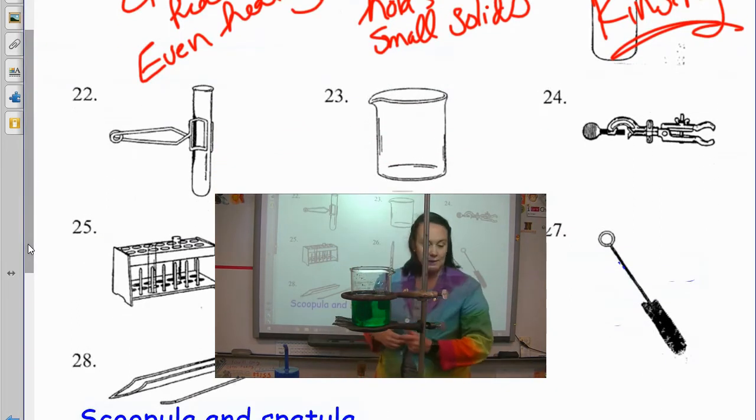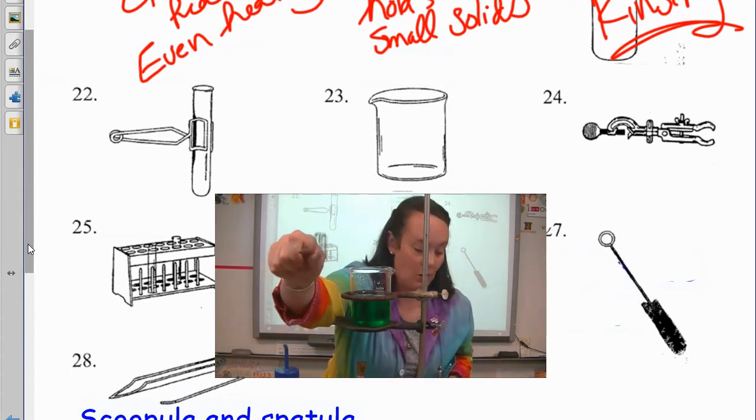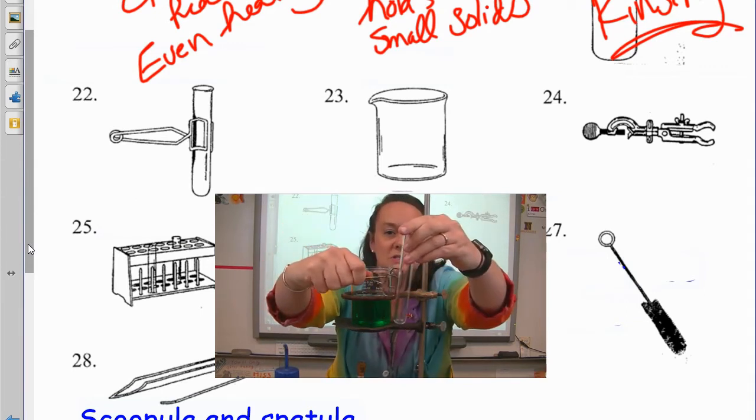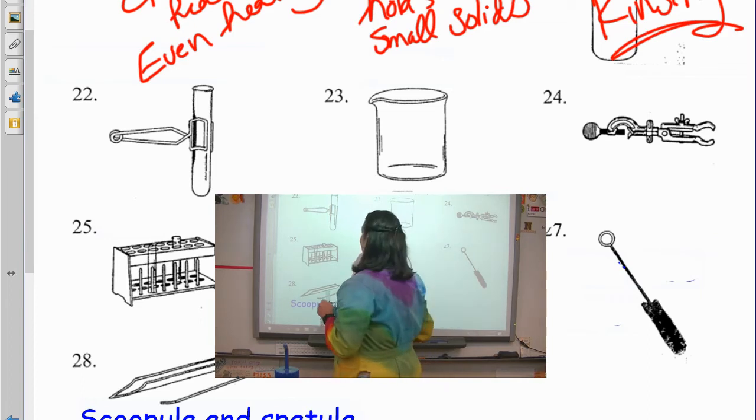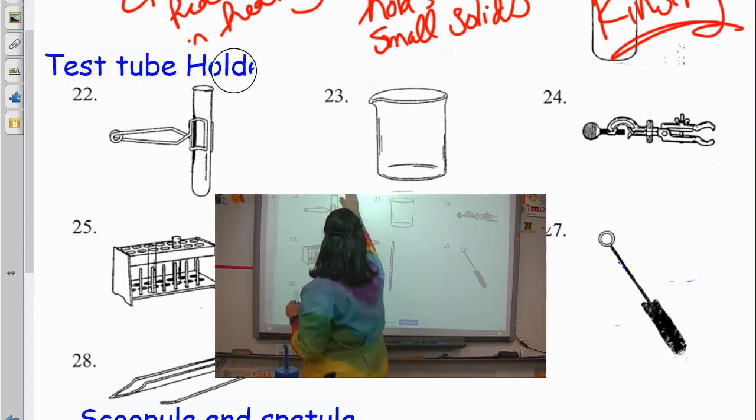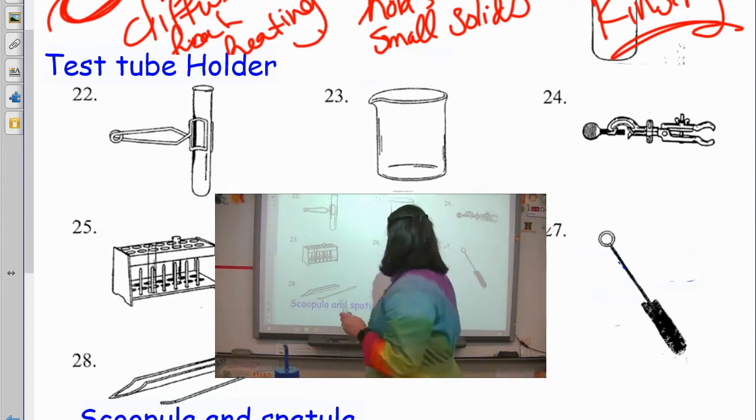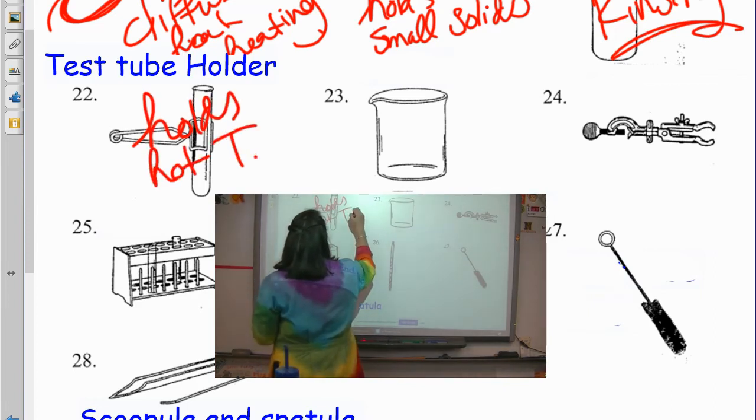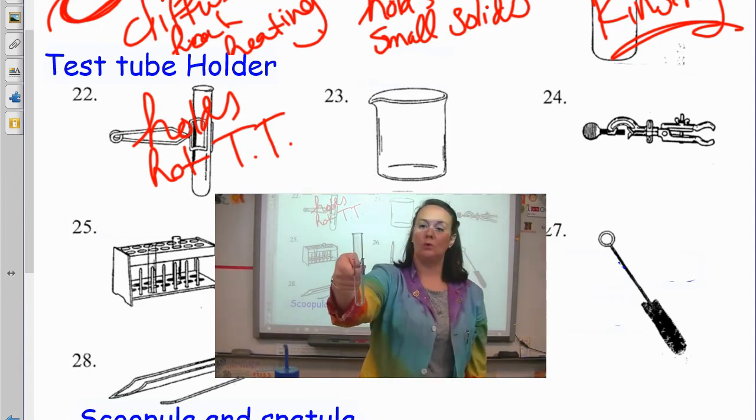Number 22 is something that we have here. Let me find that. Here we go. This guy's really small. You can already see what he does in the picture. What we're going to do is we just take this here. It is called, this is called a test tube holder. Test tube holder. And all that does is that holds hot test tubes. Holds hot test tubes.